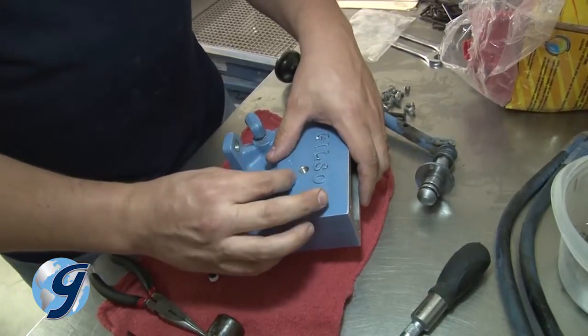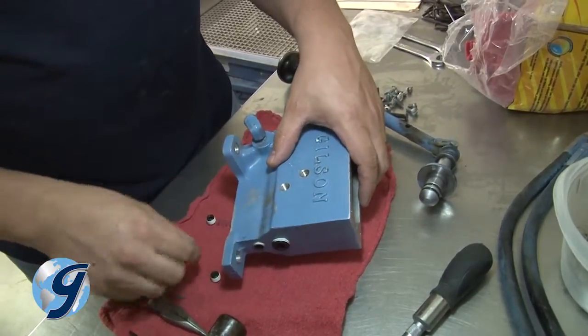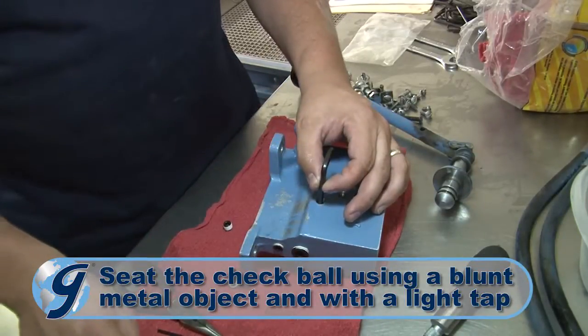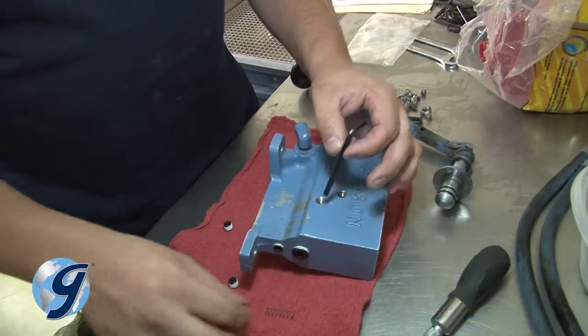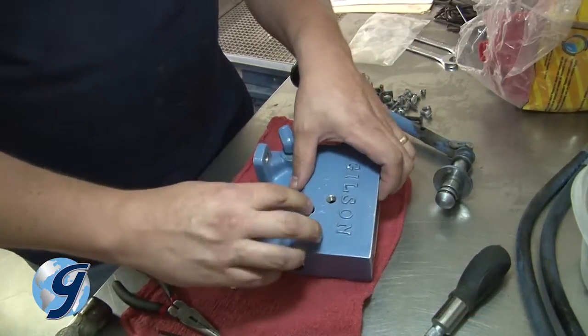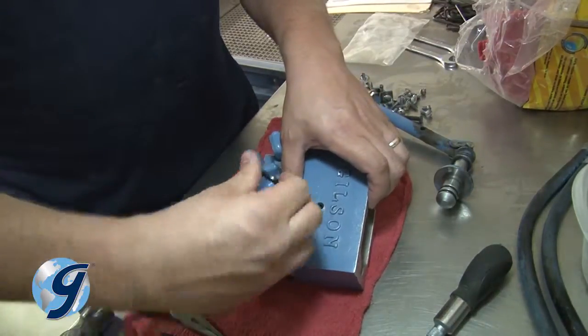Now install the intake check ball and, using a blunt metal object with a light tap from the handle of a hammer or mallet, seat the intake check ball into place. Next, install the intake spring — the longest and thinnest spring in the repair kit — and finish with installing the new plug.